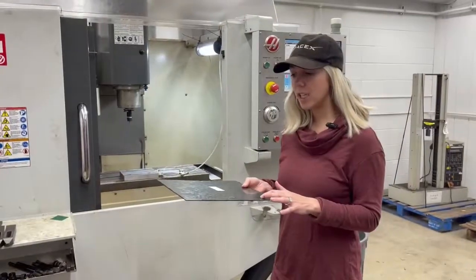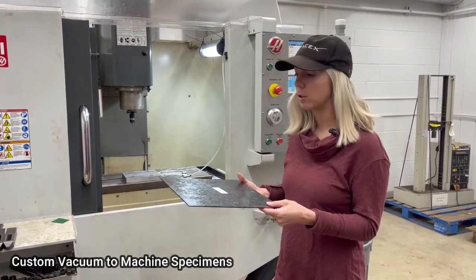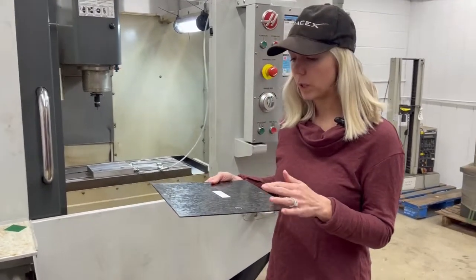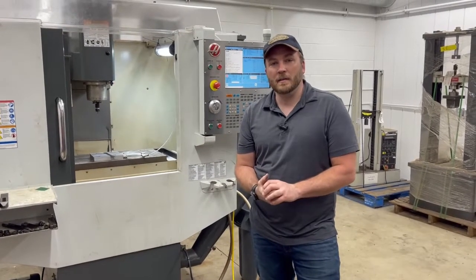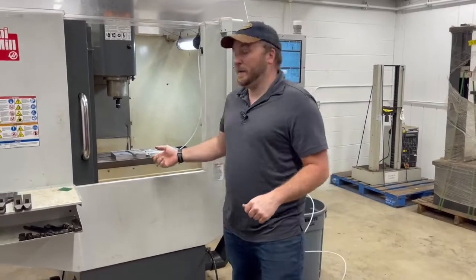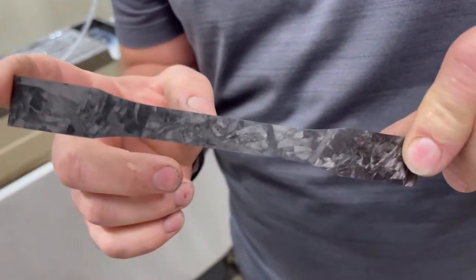Thin sheet is very difficult to machine — it's unable to clamp in the vise, which is why we had to create a custom vacuum table to produce specimens under D638 Type I. The custom vacuum table allowed us to hold the sheet of carbon fiber down without clamps. This let us cut our dog bone specimens, which gives us a reduced sample area so we know where the specimens are going to break.